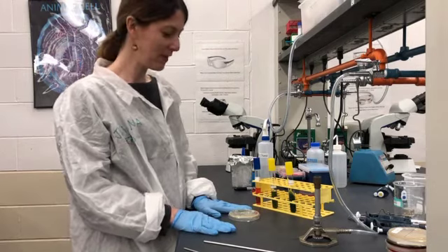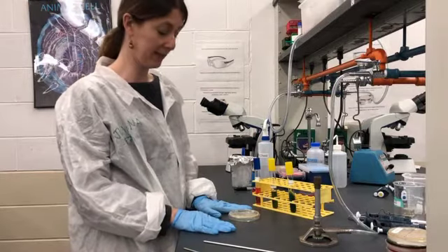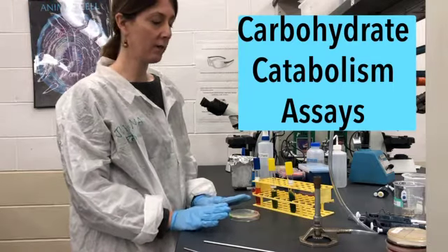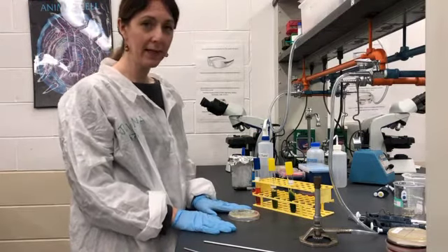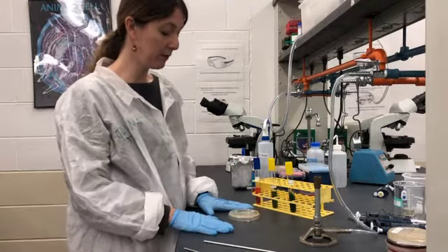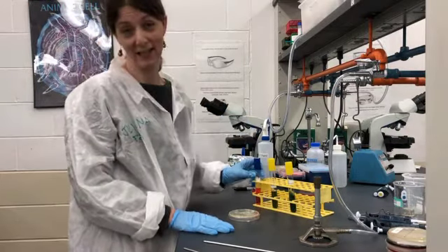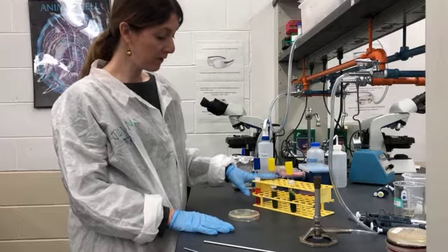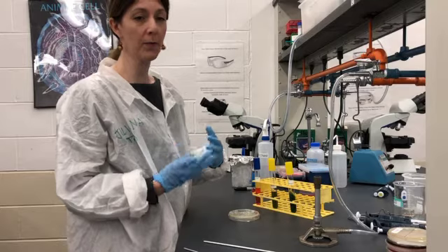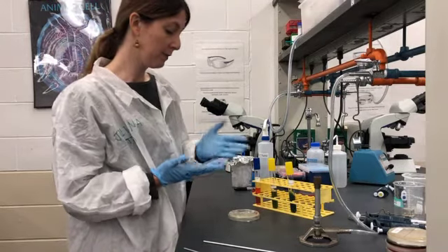Hi everyone. So in this week's lab, we are going to be focusing on carbohydrate catabolism assays. I gave you a lot of background information about each of those assays, and quite frankly, it takes a lot longer to explain all the science and biochemistry behind each of the medias that we'll be using, and it takes a lot less time to actually inoculate the tubes. So in this short video, I'm going to show you the different types of media that we'll be using so that you're prepared to inoculate all this media when you come into class on Tuesday.